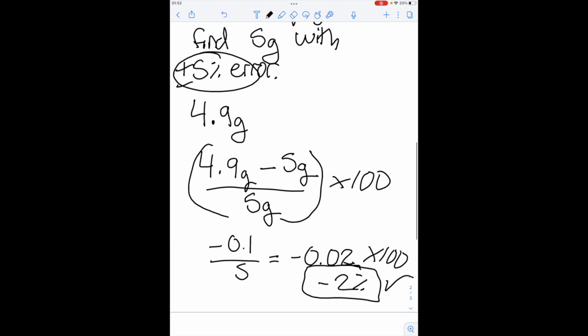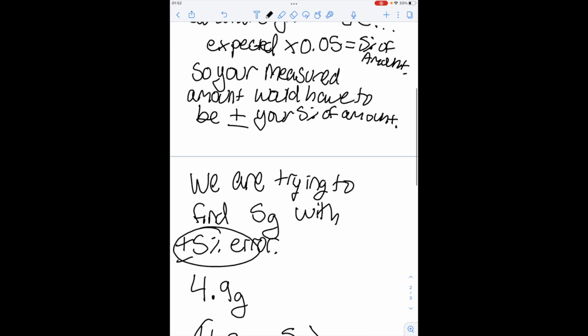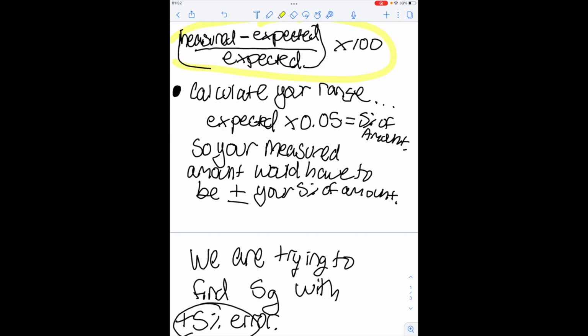Okay, so next we're going to use the same example of the 4.9 grams, but we are going to use this formula. Expected times 0.05 equals 5% of that amount. And then we're going to write our range down and make sure that whatever we're measuring falls within our range. So that way you don't have to keep doing math equations. You can just do this once.